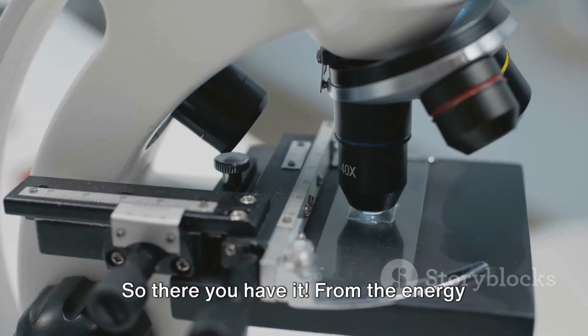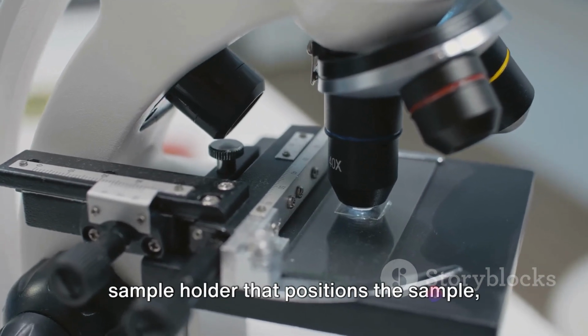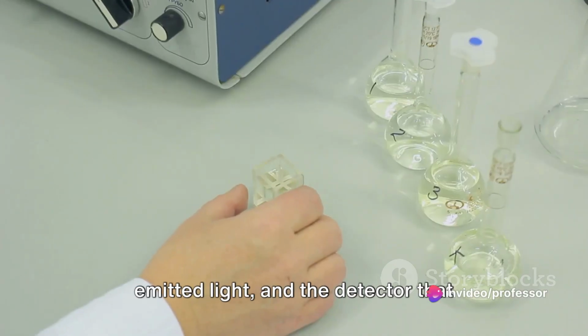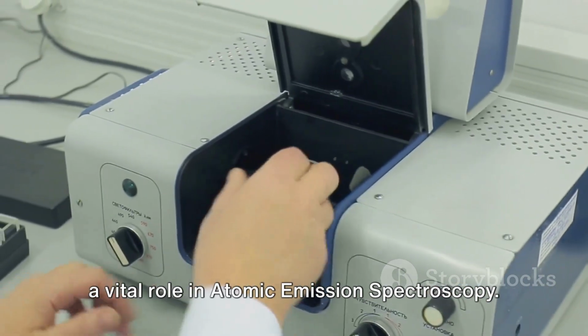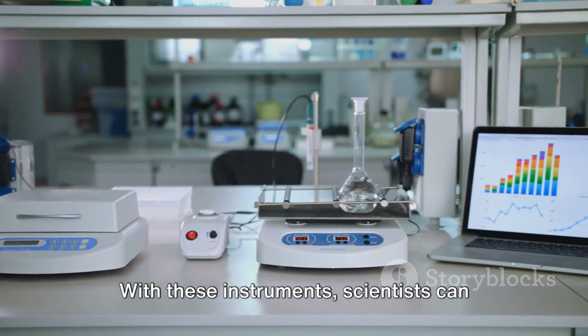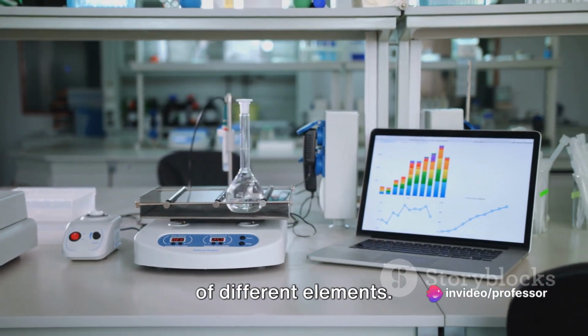So there you have it. From the energy source that excites the atoms to the sample holder that positions the sample, the monochromator that isolates the emitted light, and the detector that measures this light, each instrument plays a vital role in atomic emission spectroscopy. With these instruments, scientists can accurately detect and measure the presence of different elements.